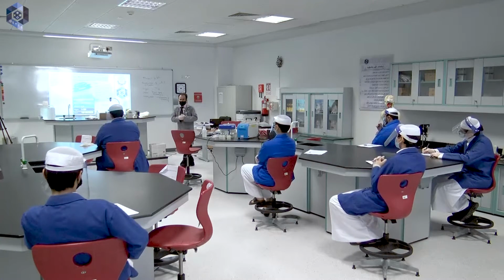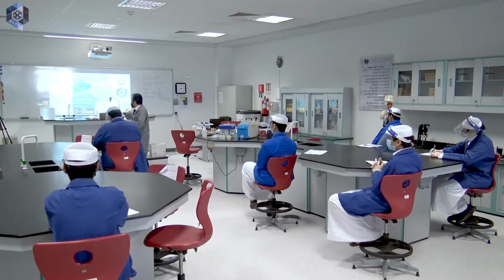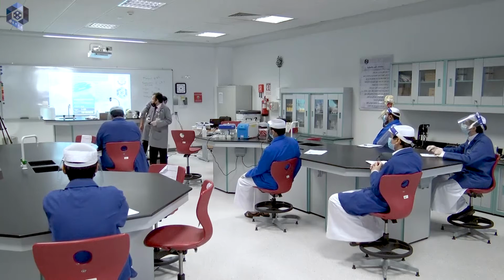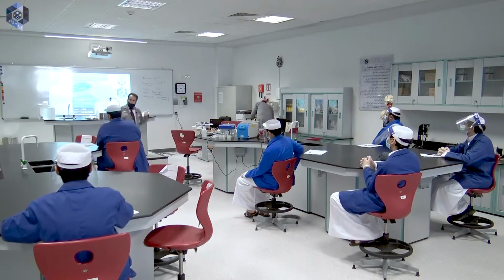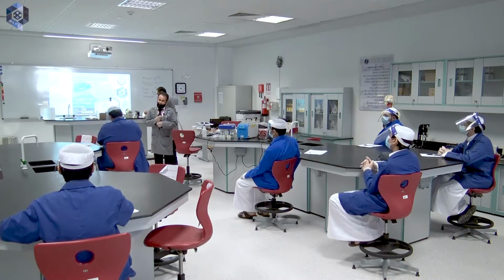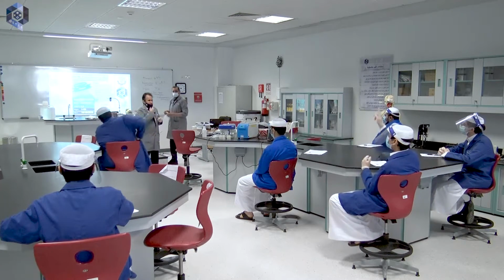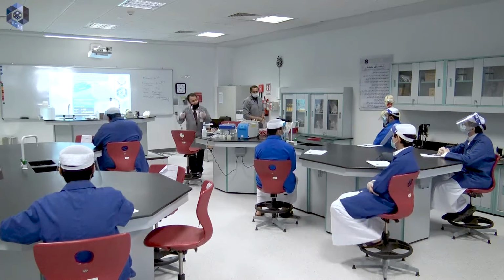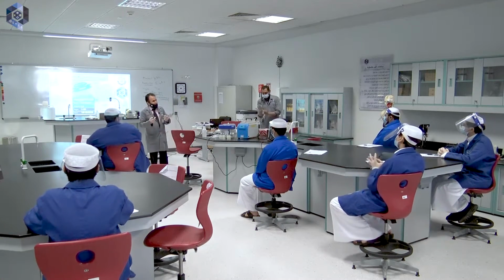We'll continue with this same experiment that we started before. Nassar, can you please read the title of today's lesson? Gene cloning. Now, in this title, there are two keywords. What are these two keywords? And what is the second word? Gene. Now, what does cloning mean? Yes, making millions and millions of copies. What thing are we going to clone in this experiment?